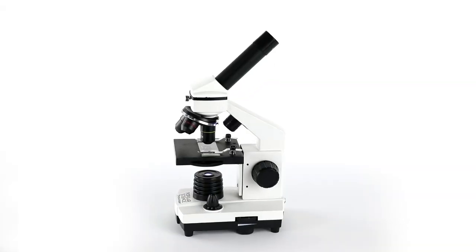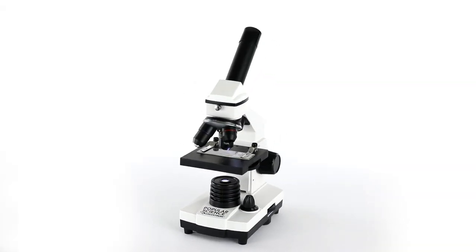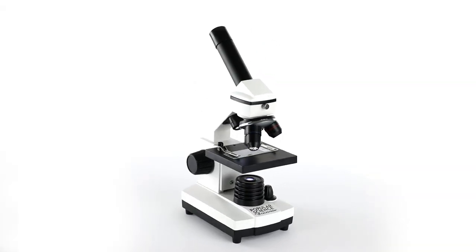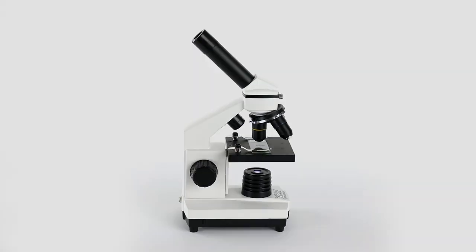The possibilities are endless with Popular Science and Celestron Labs. Begin your exploration!